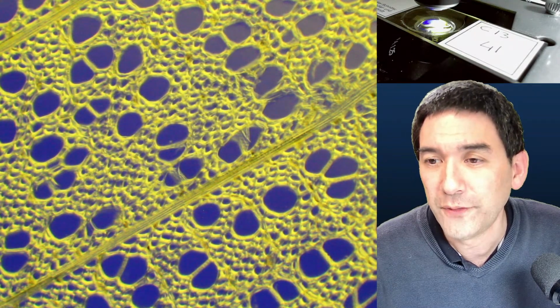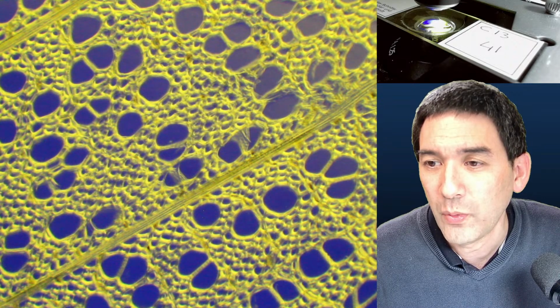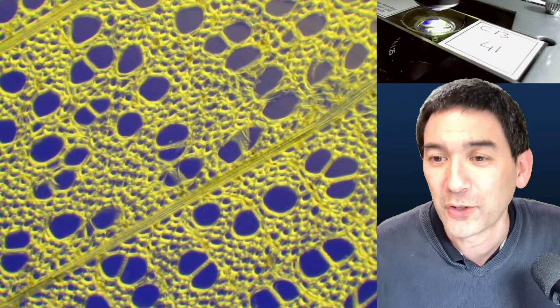So what's the difference between LED and halogen lamp? Sorry for the newbie question. I'm weighing up a new microscope as you've got me hooked. Okay.